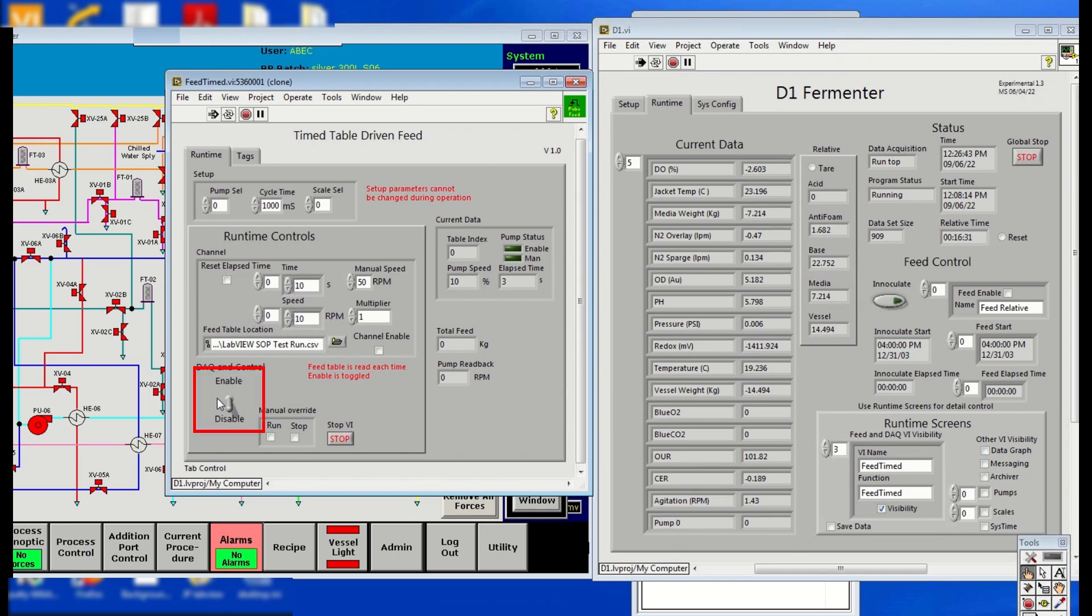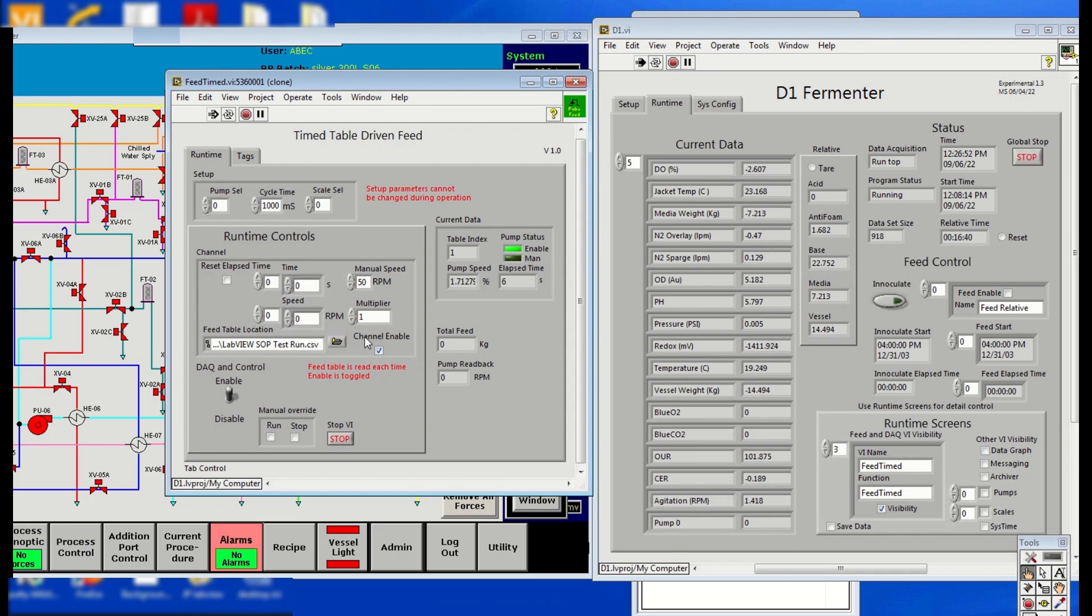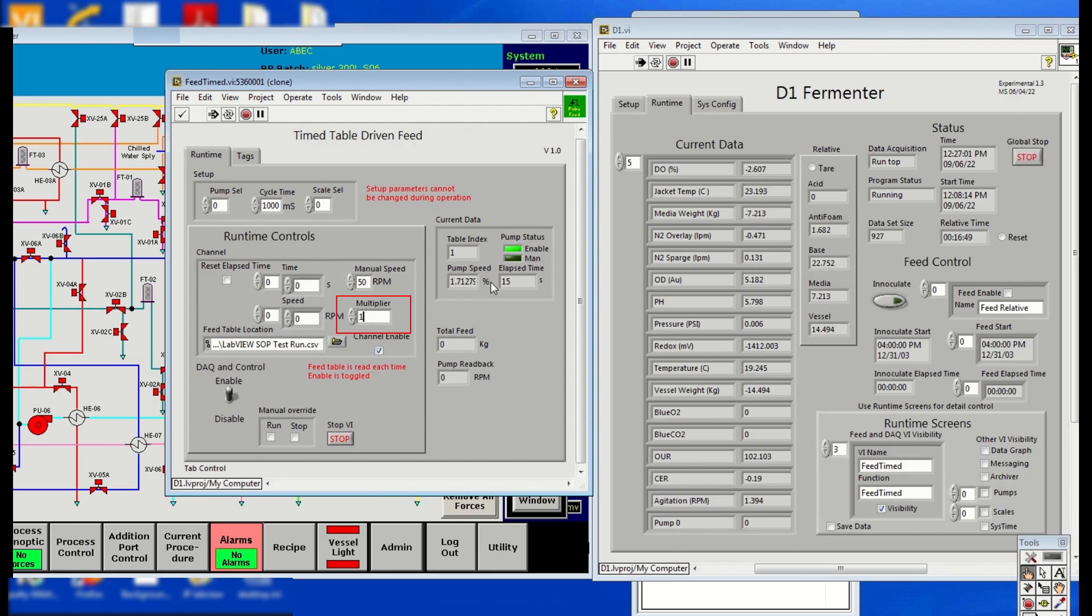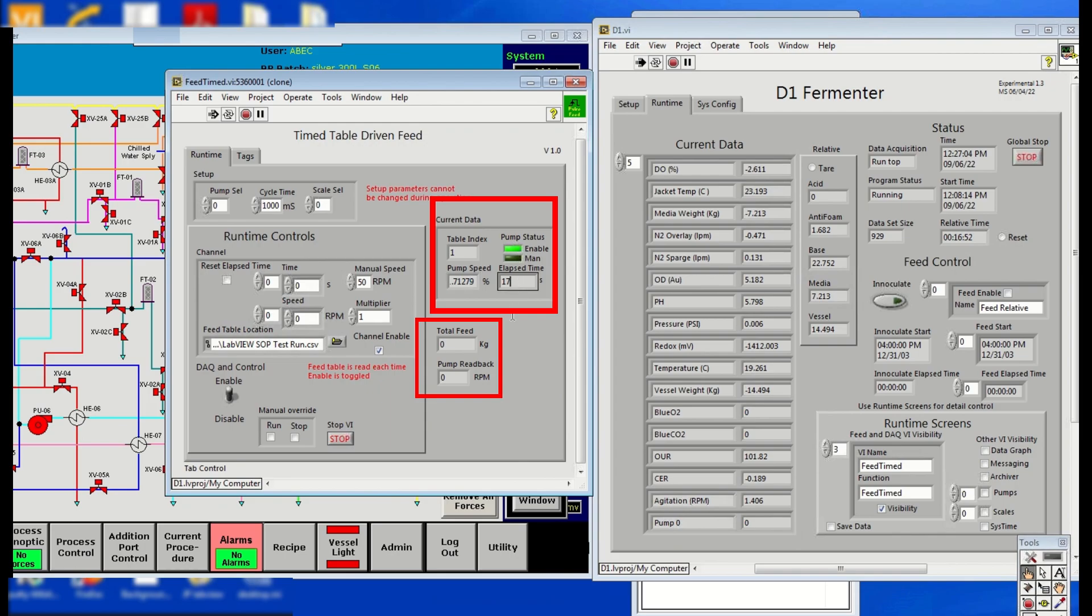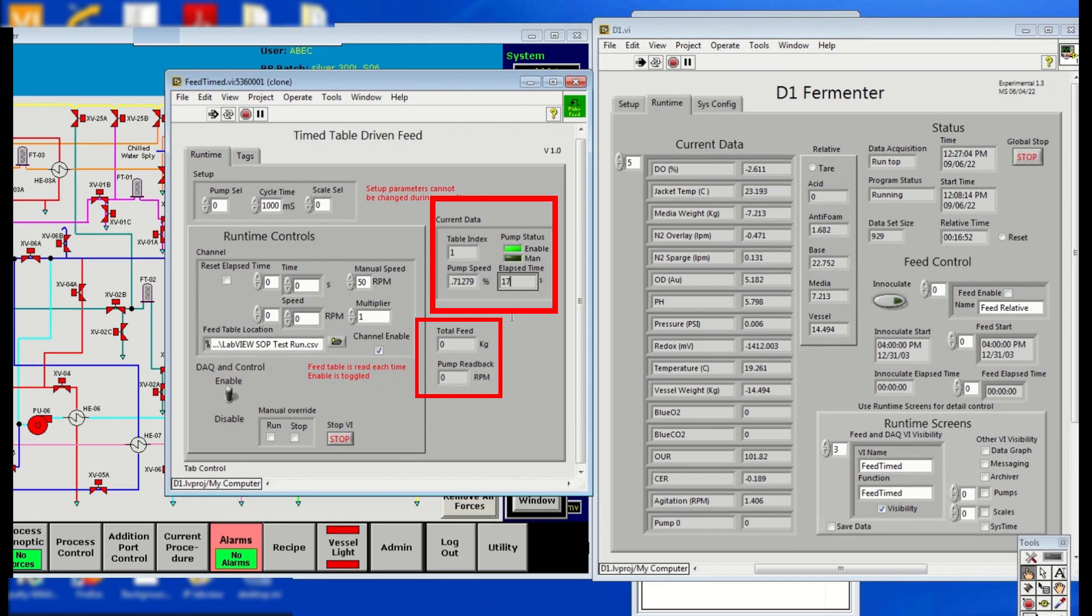Click Enable. Check the Channel Enable box. If needed, the multiplier can be changed to adjust the pump speed without changing the feed table directly. Check that the pump speed elapsed time, total feed, and pump readback are showing up correctly. Check these values not only in the Timetable-driven Feed panel but also in the Pump and Scale windows.